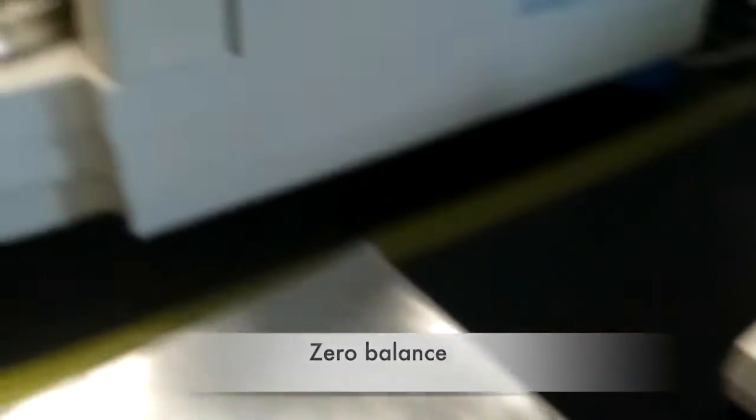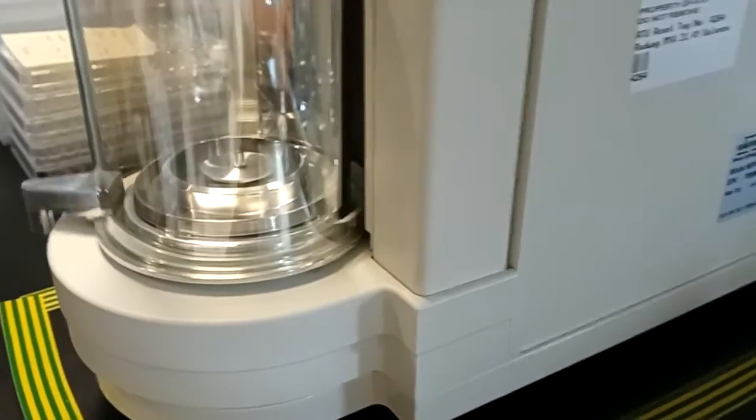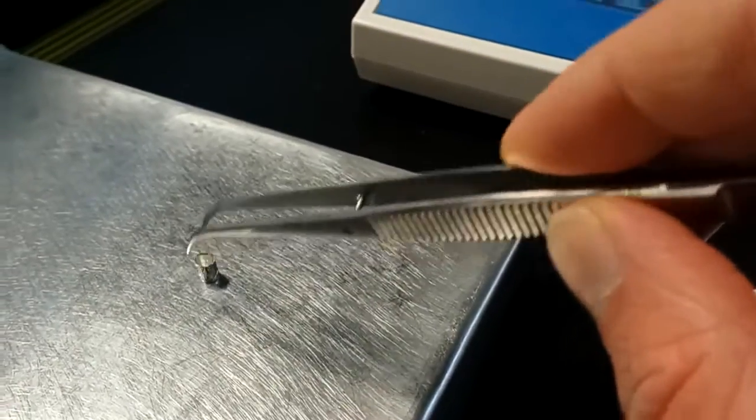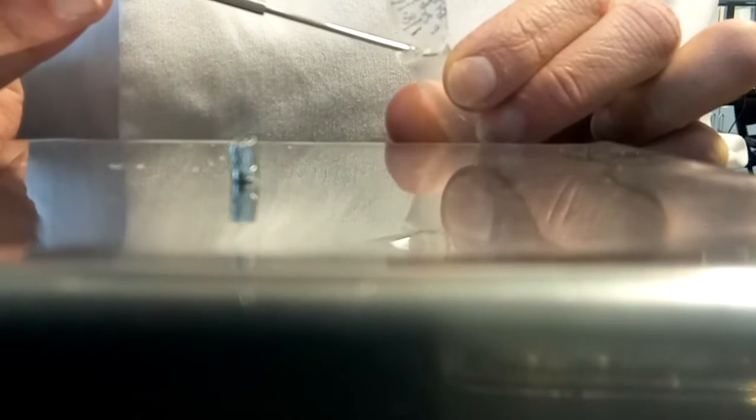Next, zero the balance using whatever vessel you're going to be weighing your sample into. Once the balance has been zeroed, you can weigh out your sample, making sure that you remember to re-zero the balance for each new sample that you do.